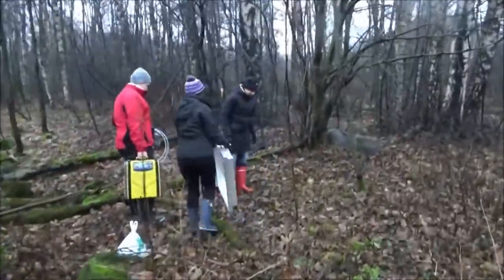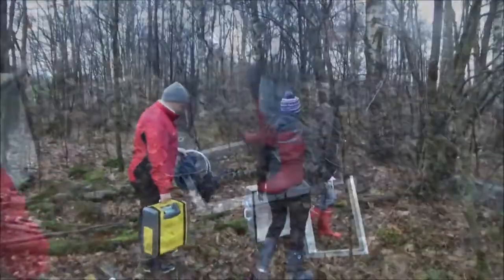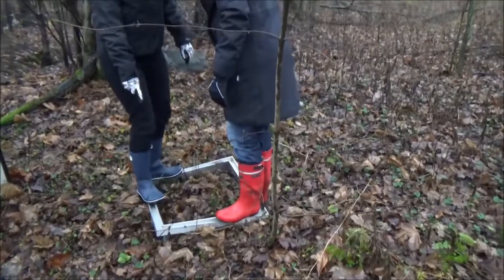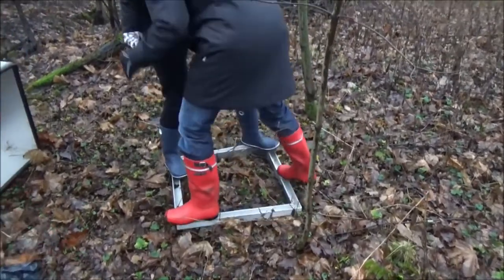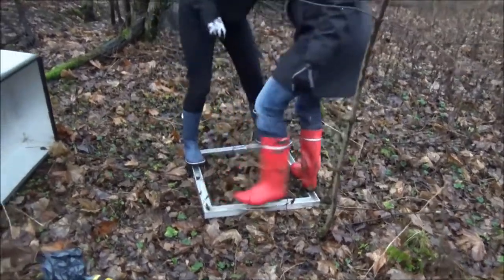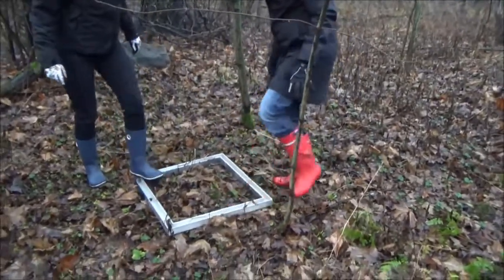The first measurement site was a young forest in northern Helsinki. Before starting the measurement, the collar was placed on the ground to prevent lateral flow of gases. The target was to apply even pressure across the collar and to mount it deep enough.